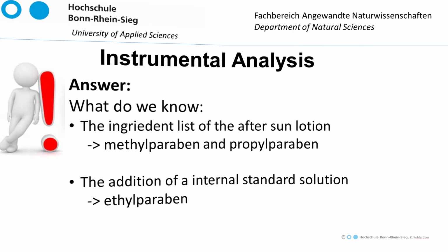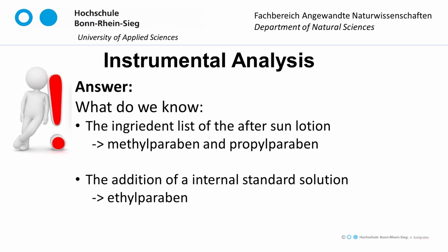Answer. What do we know? We know the ingredient list of the after sun lotion. It contains methylparabene and propylparabene. And we know that we add an internal standard solution which contains ethylparabene. That's the reason why we get 3 peaks.